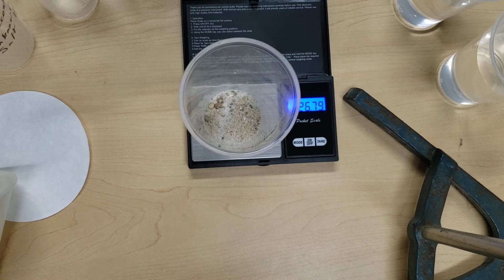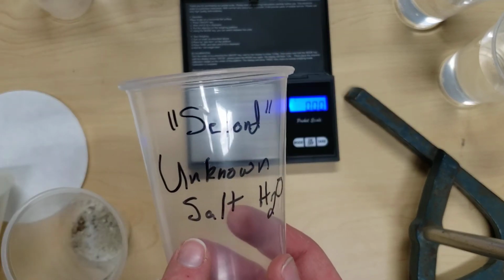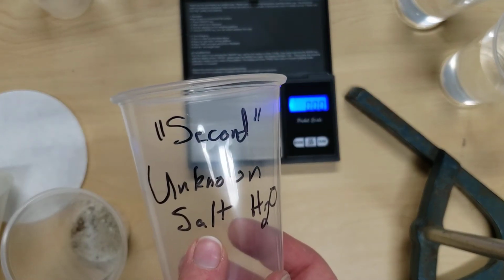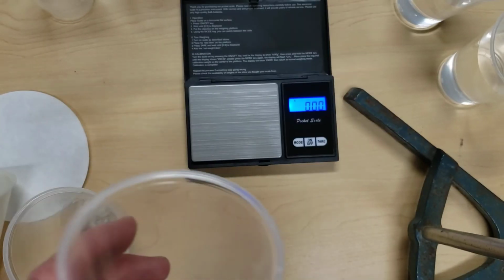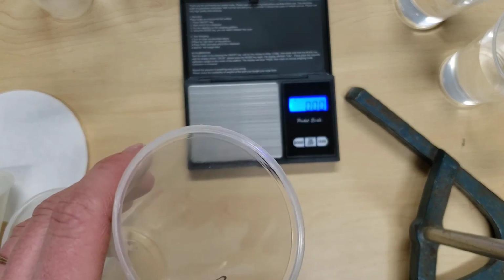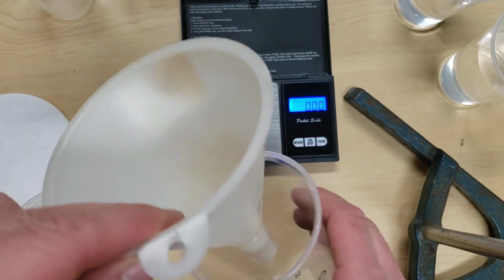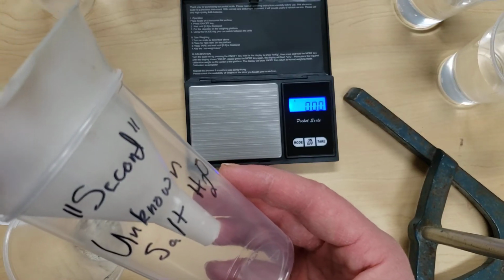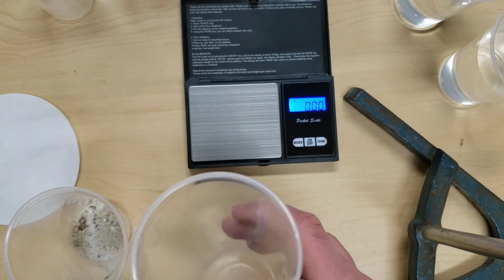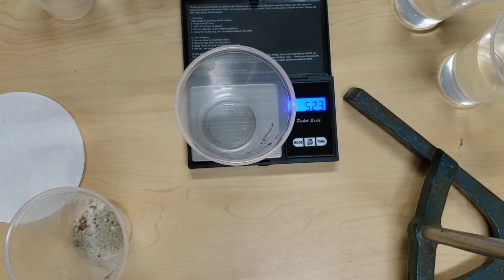Now we want a second container that we're going to filter into. So a second container, unknown salt or sand, and it's pretty helpful if the opening of your container is smaller than the funnel that you're going to use, because then it sits right onto that container and you don't have to hold it. So we want the mass of this second container, and you want to record that.